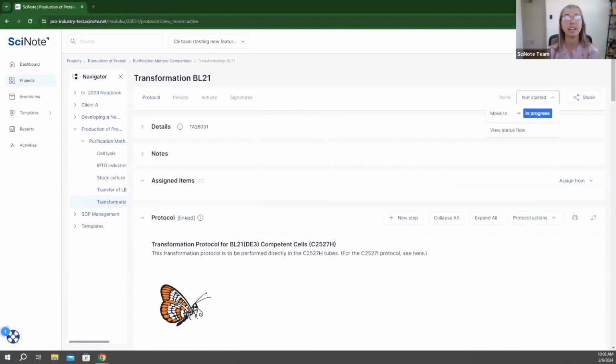If your workflow deviates from this progression, or maybe you're struggling to make this progression fit with your team, you've used different naming your entire company career, or you've even used a different flow since you've started, our professional services can help tailor that to your current flow. We can help design a task flow with the new stages that you have and responsibilities at each step. So depending on what the task might do or what you're allowed to do at that step, tailored precisely to your needs.